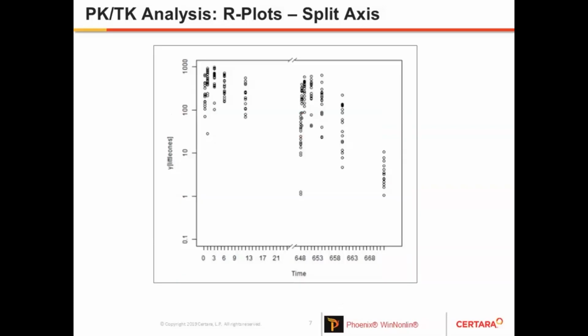Next slide. Another desire is split axis. This is a highly popular topic in support. As you can see, you have an axis. In this particular case, it is the x-axis that stretches over a wide range and where there's nothing happening in the middle of the axis. So people want to cut out this useless part of the axis.